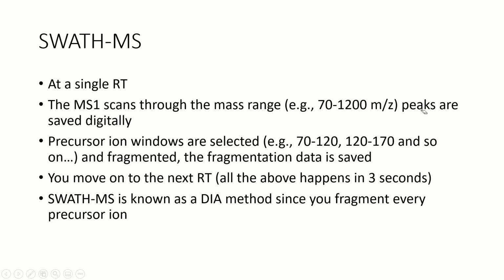Now, coming to SWATH-MS, it is a little bit different in the way that it is a data independent acquisition technique, DIA. It is also called the DIA technique. Now, what the DIA technique basically is, it does not depend on the underlying data or the underlying analyte molecules that you are using.